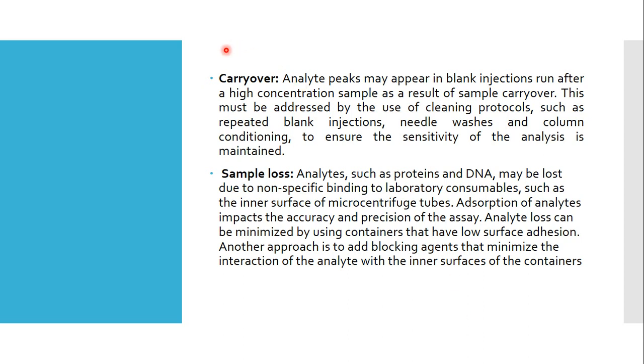Next limitation is carryover. Analyte peaks may appear in the blank injection run after a high concentration sample as a result of sample carryover. So to remove this, cleaning protocols should be used, such as repeated blank injection. Then you can do needle washes and column conditioning to ensure sensitivity of the analysis is maintained. Next limitation of LC-MS/MS is sample loss.